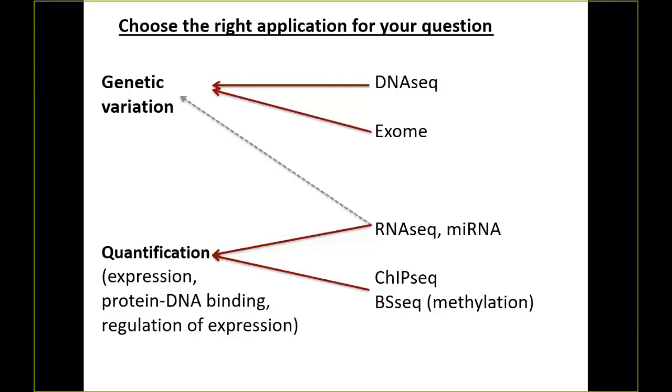Now, a lot of times I could talk to them a little bit more and get them to tell me there were some very specific variants they wanted to know about. And if they wanted to know about a very specific variant, I could go back, look at the RNA, and see if I could detect that variant in the RNA being expressed. And if that variant was being expressed, I could tell them it was present. Sometimes I could tell them it looked like it was absent. And occasionally, actually pretty frequently, I had to tell them that their sequencing depth was too low, and I didn't even get enough counts in that region of the gene that I could reliably say there's a variant present or absent. So unfortunately, it doesn't work.